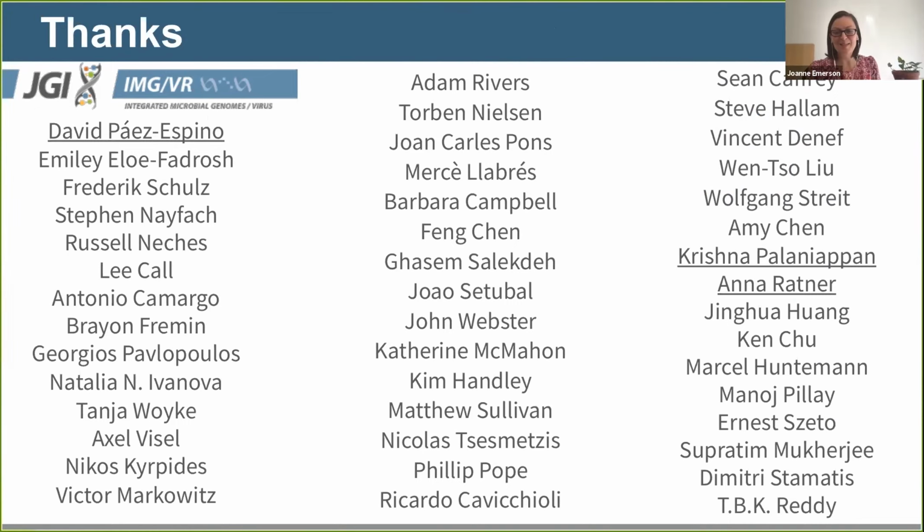Great, thank you. Excellent talk, Simon. So we're going to take one super quick question, and I think this might be a longer answer, so we can cover the rest in the panel. But just a quick response. What is the definition of a high quality phage genome sequence, and what kind of criteria and or software execution need to be validated or done before we can say we have a complete phage ready for deposition to NCBI?